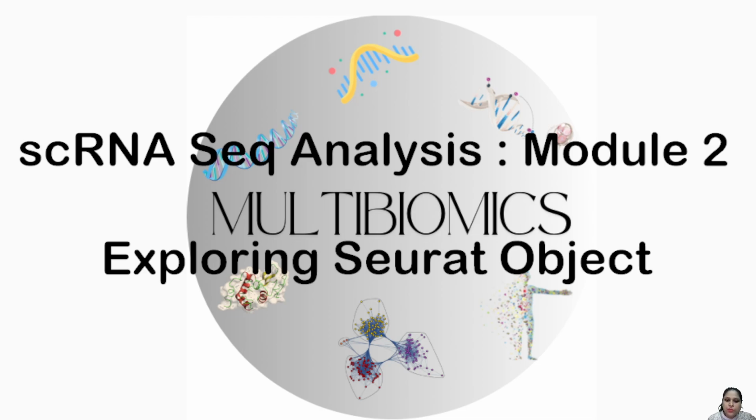So we'll start by plotting the distribution of the detected molecules and the genes per cell to assess the data quality and the variability present in it. Then we will dive into the Seurat object itself, and we'll examine the different assays and the different expression matrices, and inspect the metadata that provides valuable cell level information.